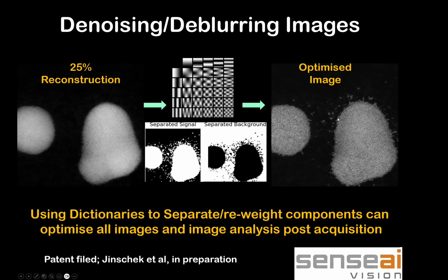This is not increasing the spatial resolution of the image. It's all here. It's a lower signal to noise, but effectively that resolution is present. So here you can see the gold nanoparticles has much higher resolution, including that bit where we couldn't quite resolve it in the live image. We can also see individual atoms in between these larger gold nanoparticles. These individual atoms are essentially seen moving around, and you can see those very, very clearly.